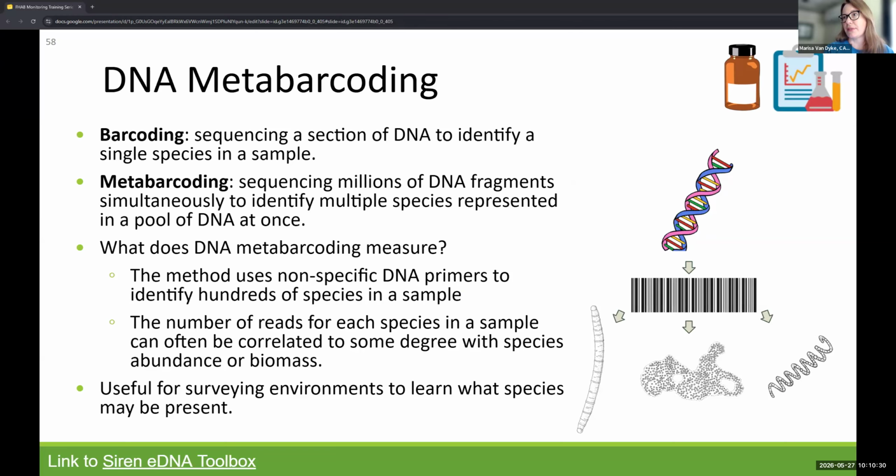It yields similar results to microscopic identification, and it's more accurate because it relies on the DNA of the organism to identify rather than the human eye, which can have error, or sometimes the cyanobacteria itself is challenging to identify because it's degraded some, or it's at a certain life stage where it's difficult to distinguish among other genera in that family. So again, it's a substitute that's more specific than microscopy-based identification.